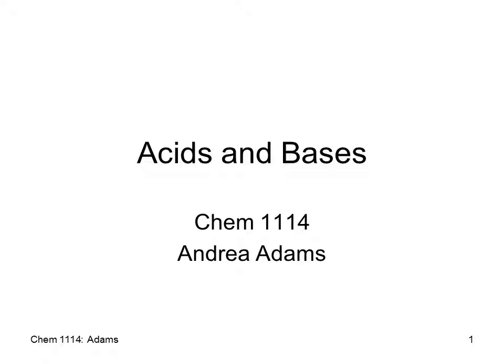Everybody, thanks for listening to this Acids and Bases Complete Curve Analysis lecture. It's to go with the experiment in your laboratory manual, Acids and Bases Complete Curve Analysis. You'll find what I'm going to go over, at least the blank pages of it, at the end of the complete curve analysis experiment. So why don't you turn to that now, and the title of this should be Weak Acid Strong Base Titration, the one we're going to start off with.